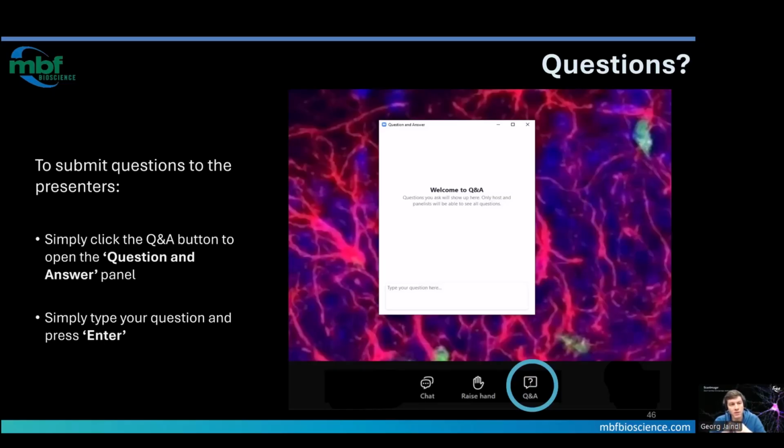It remembers for a specific zoom level what the setting is, and then tries to interpolate. So it basically builds up a lookup table. If you find that that does not work correctly, you can open up that lookup table. There's a small graphical user interface that allows you to modify that lookup table and adjust it to your scanner again. So that's an option. And if you want a demo or want to know how that works, feel free to reach out and we can help with that.